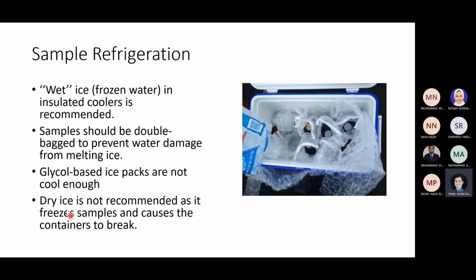Now there are a few things that you might ask me. Where do you need to add glycol-based ice pack? I've tried it before. Glycol can cool down the ice box, but not as good as ice. I mean the pure ice, wet ice that we have here. They can cool down, but not cool enough.